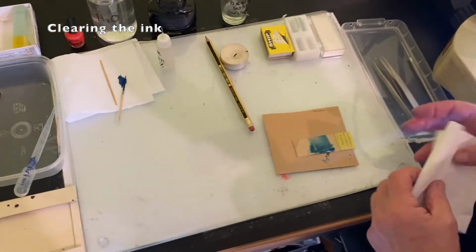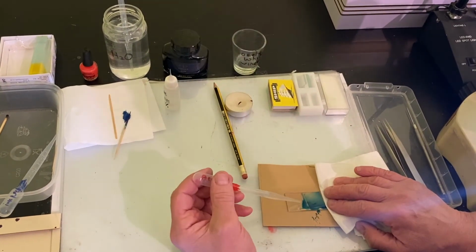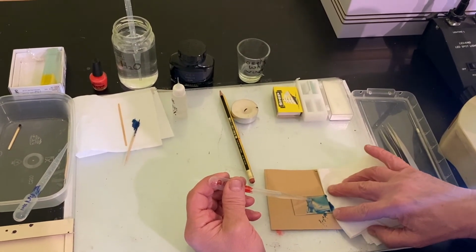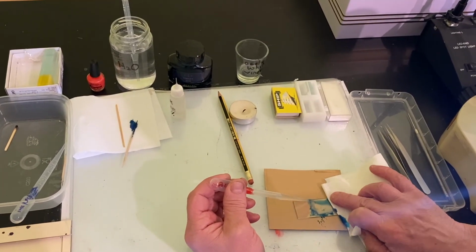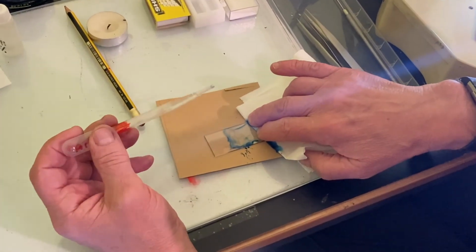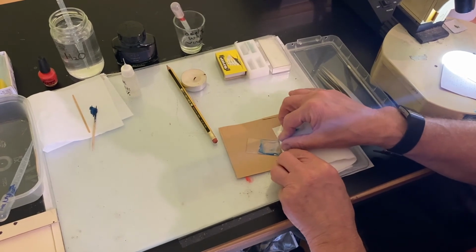Clearing the ink. Place some tissue on one side of the cover slip and then apply some acetic acid to the other side of the cover slip between the cover slip and the slide as best you can. The acetic acid will sweep through the preparation between the cover slip and the slide, clearing the excess ink. This will be aided by the capillary action of the tissue. You may have to reapply the acetic acid until the preparation goes clear.